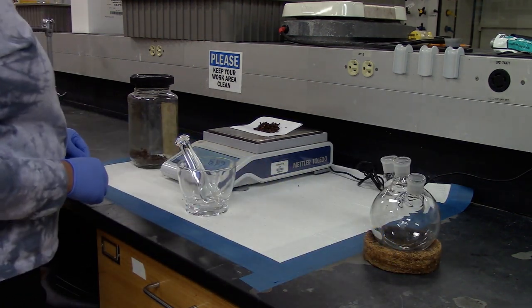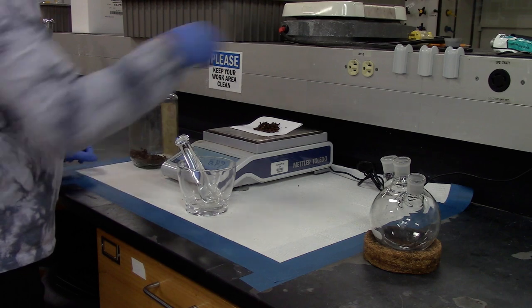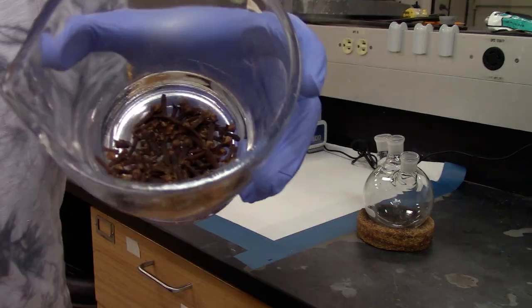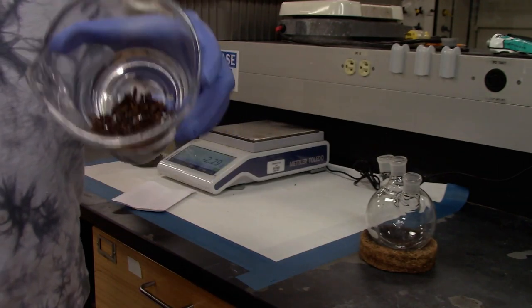Today we are going to do steam distillation and extract eugenol from clove. We will start with about 6 grams of clove and crush it.